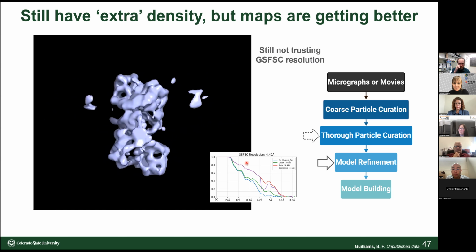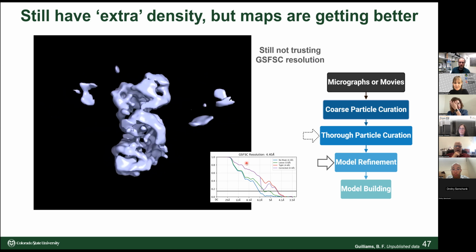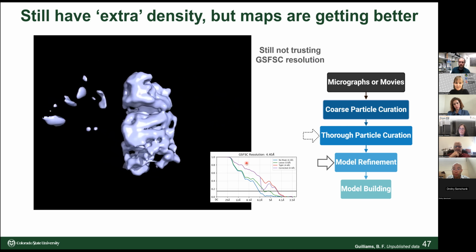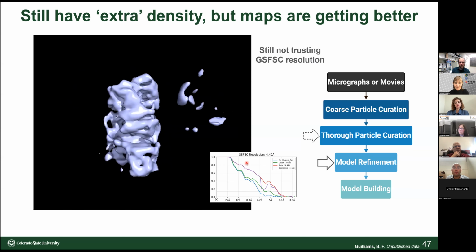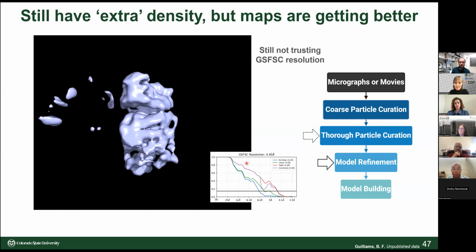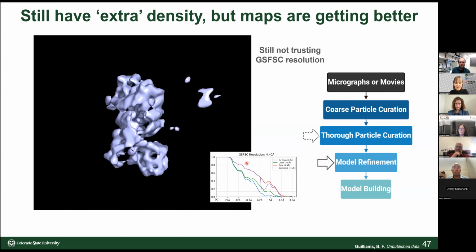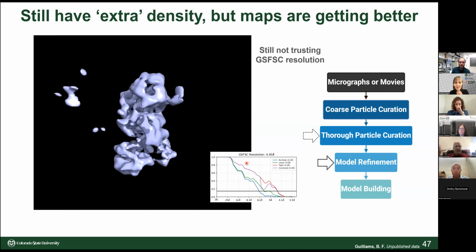There's a couple of things that occurred to me. One is that if you were working with a pixel size that was half of what the pixel size actually was, I would have thought that the defocus you got, because the CTF calculation depends on resolution, would not have been what you had said here.